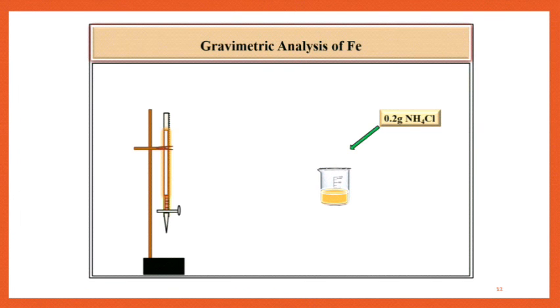Now add 0.2g NH4Cl to this hot solution and stir with a glass rod. Then add 1 to 1 ammonia solution slowly with constant stirring. A reddish brown precipitate of Fe(OH)3 is obtained.